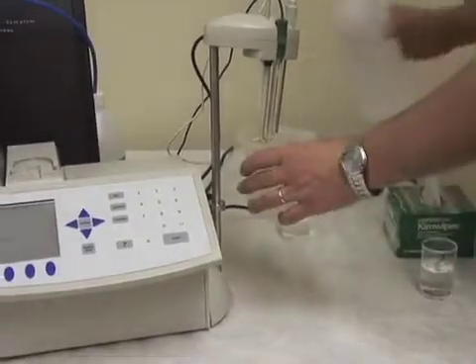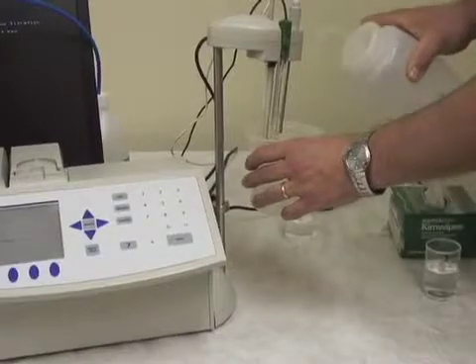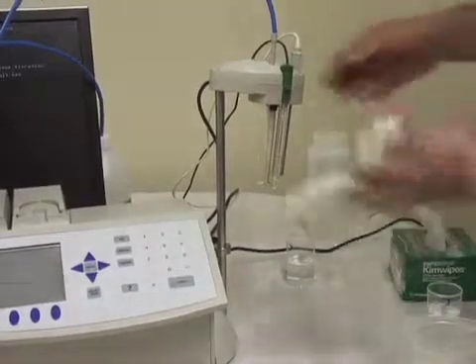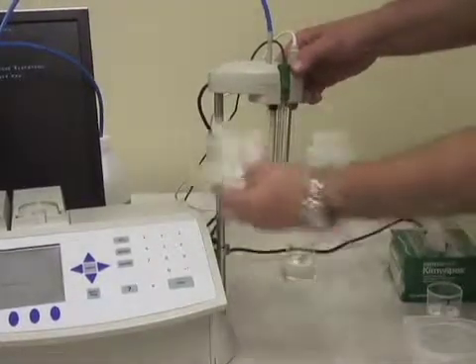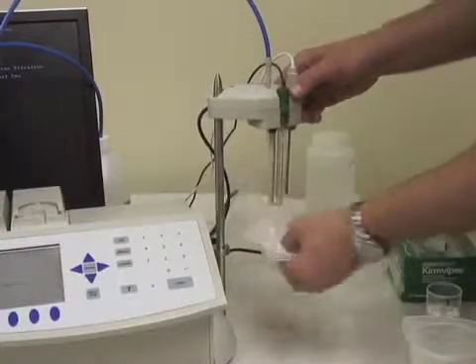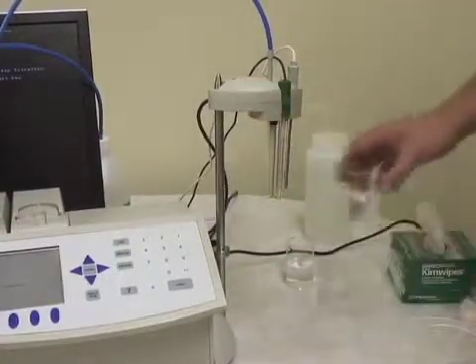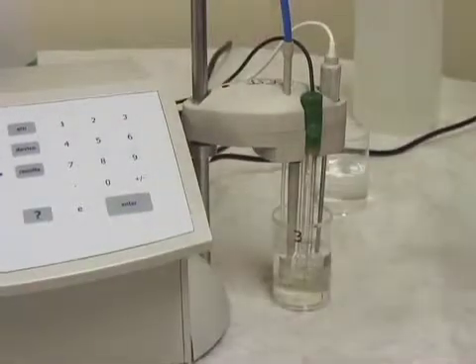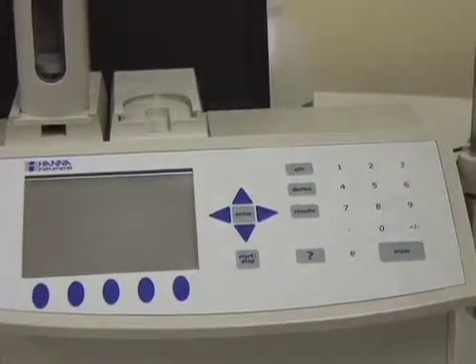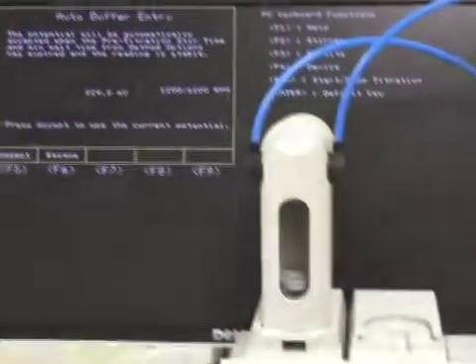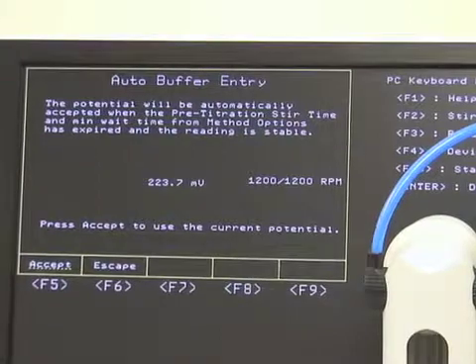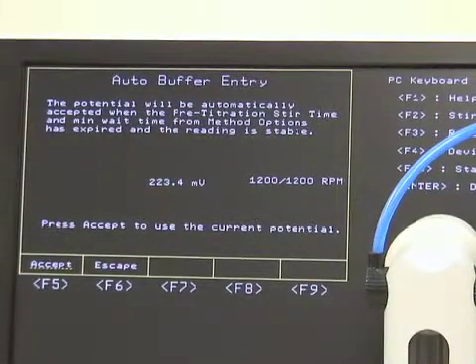We always rinse and dry between samples when doing pH calibration. We'll take our 3 buffer and simply hit accept. Just like the 7.0 buffer, it's going to run for 10 seconds mixing the sample, then take the reading. As long as it falls within a certain set of parameters, it'll accept it and go back to the pH buffer menu.